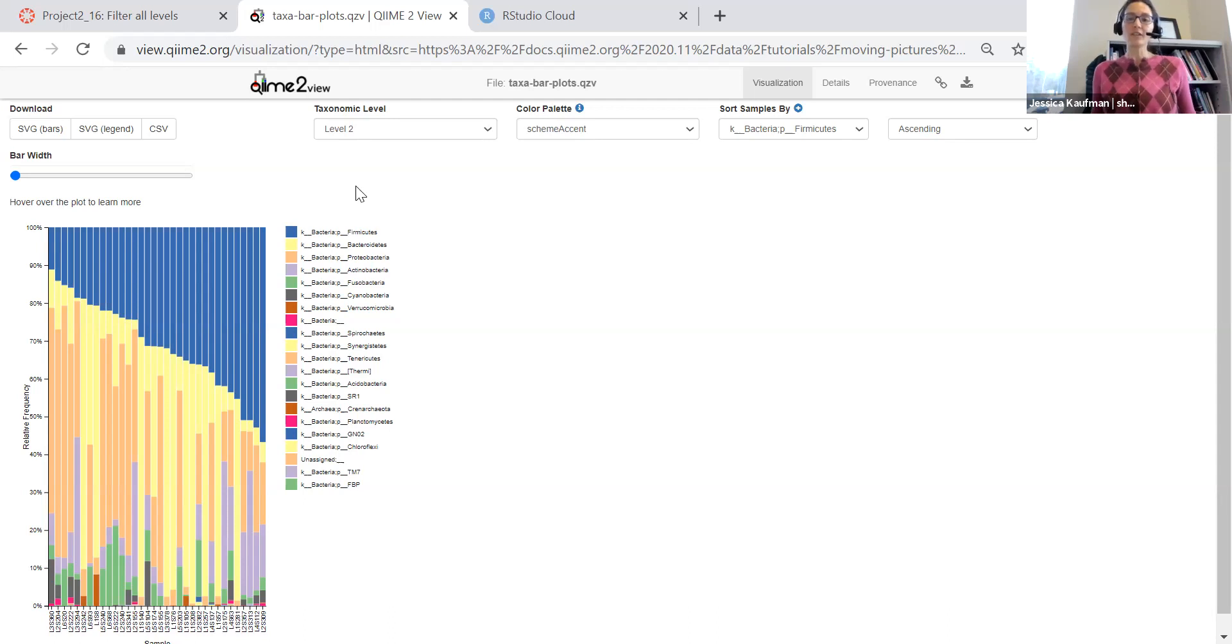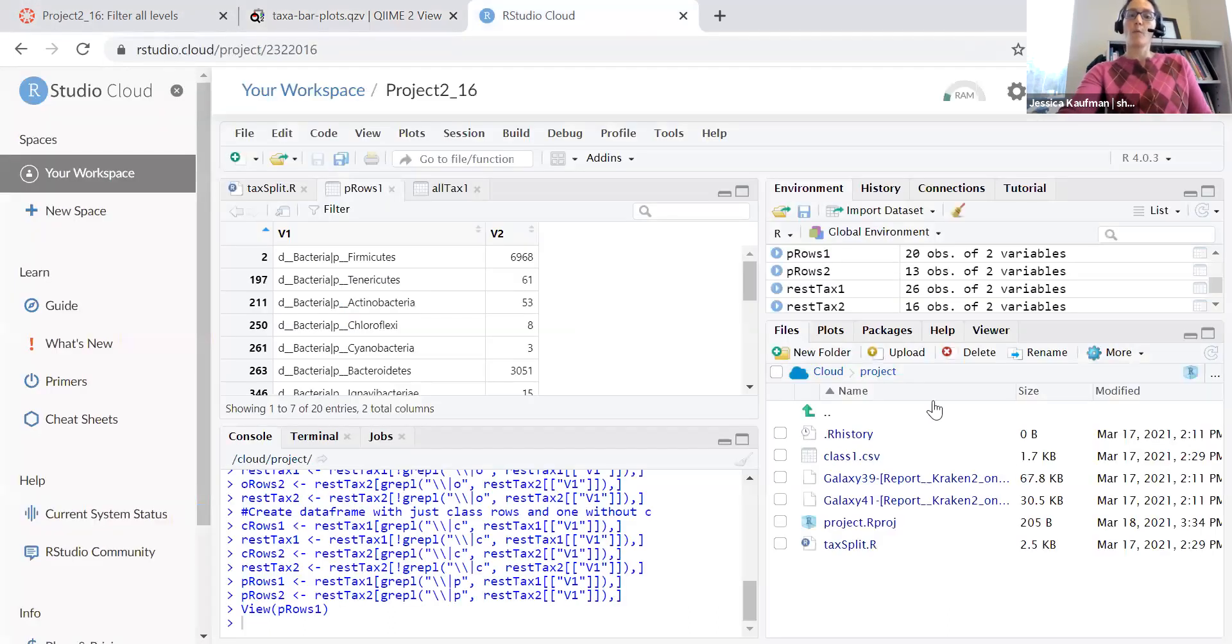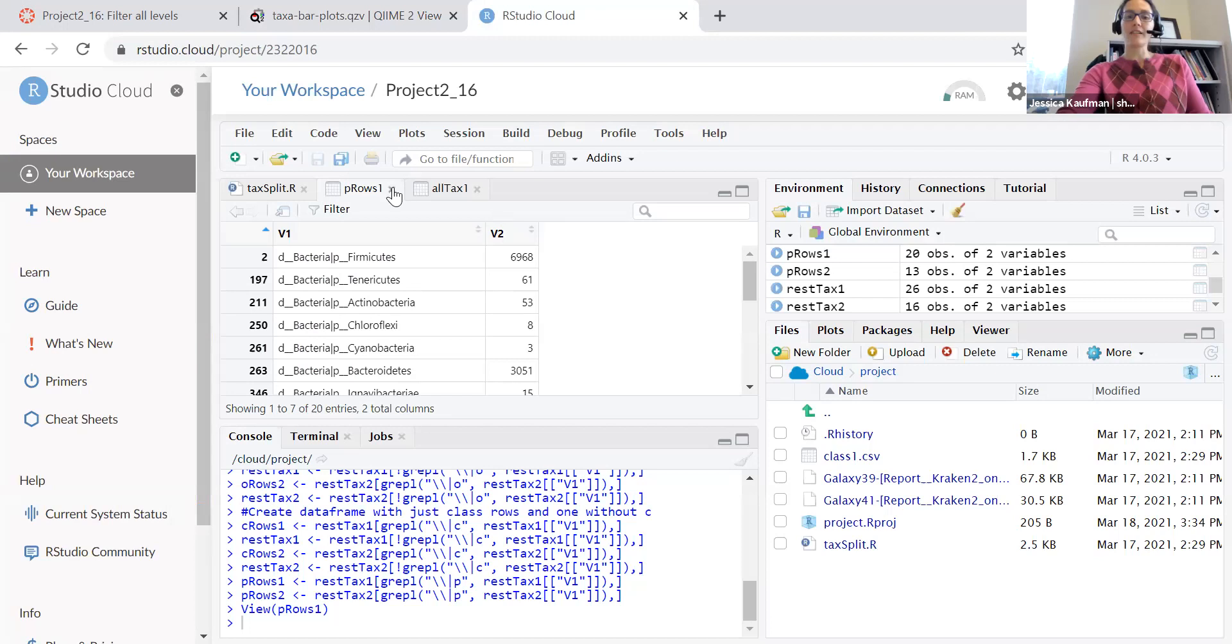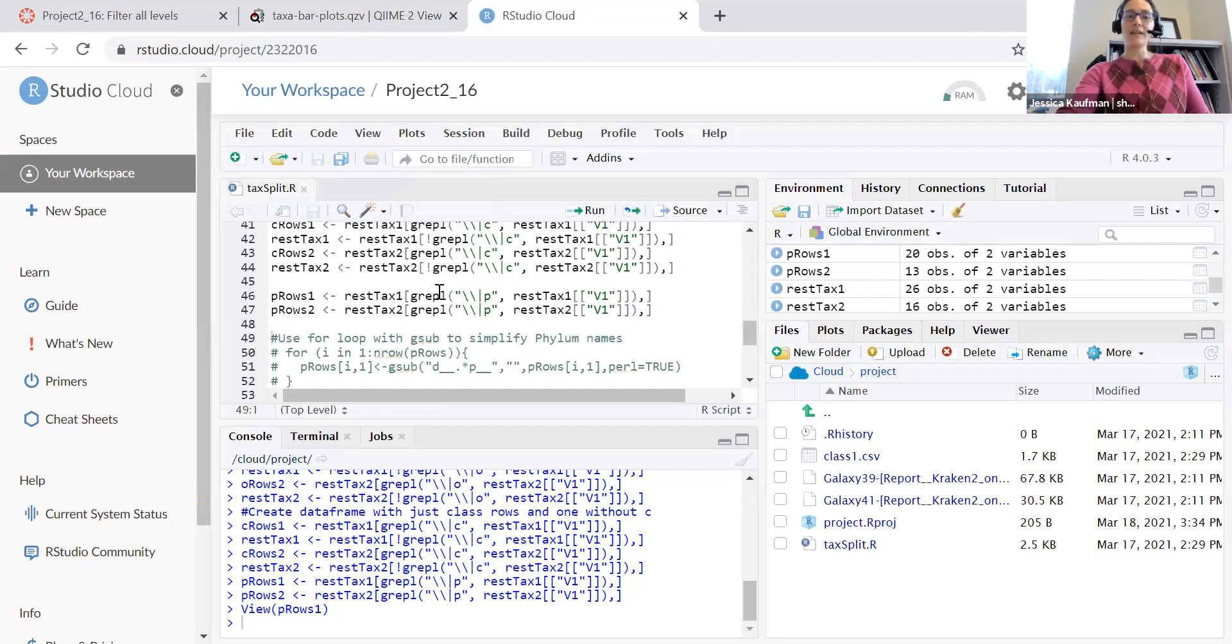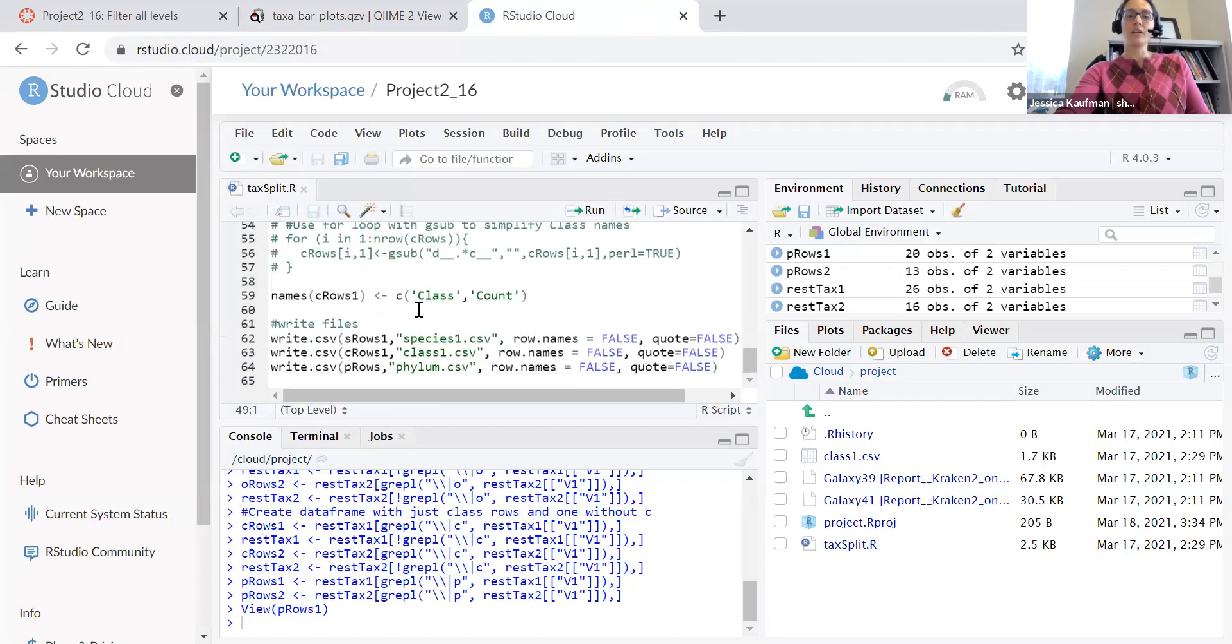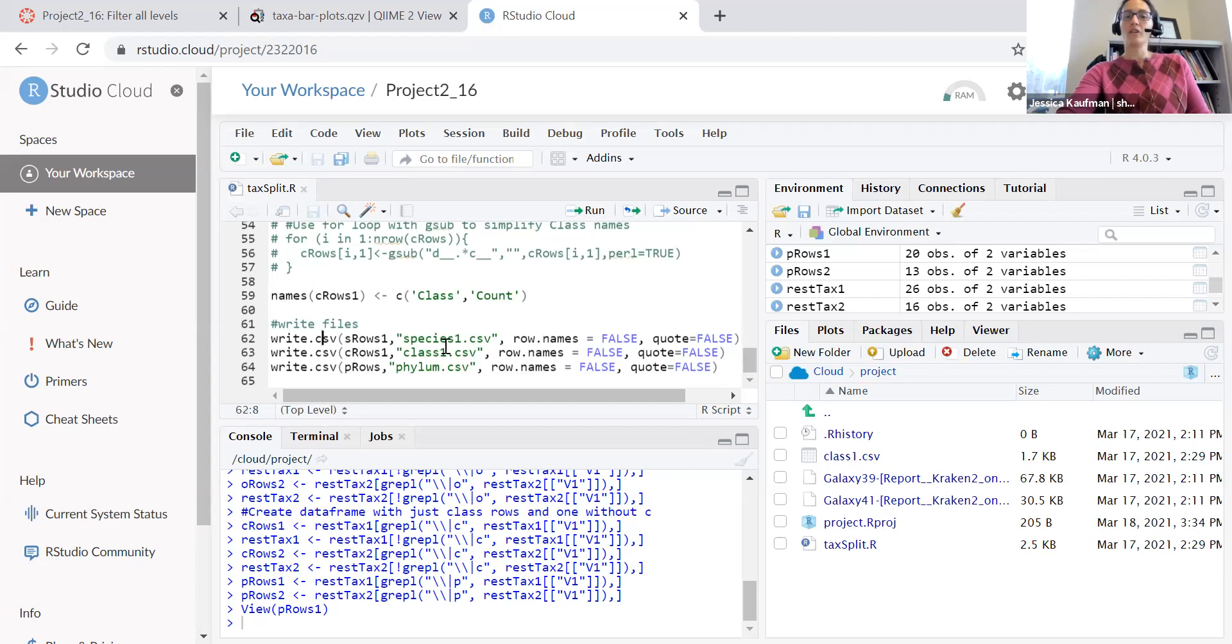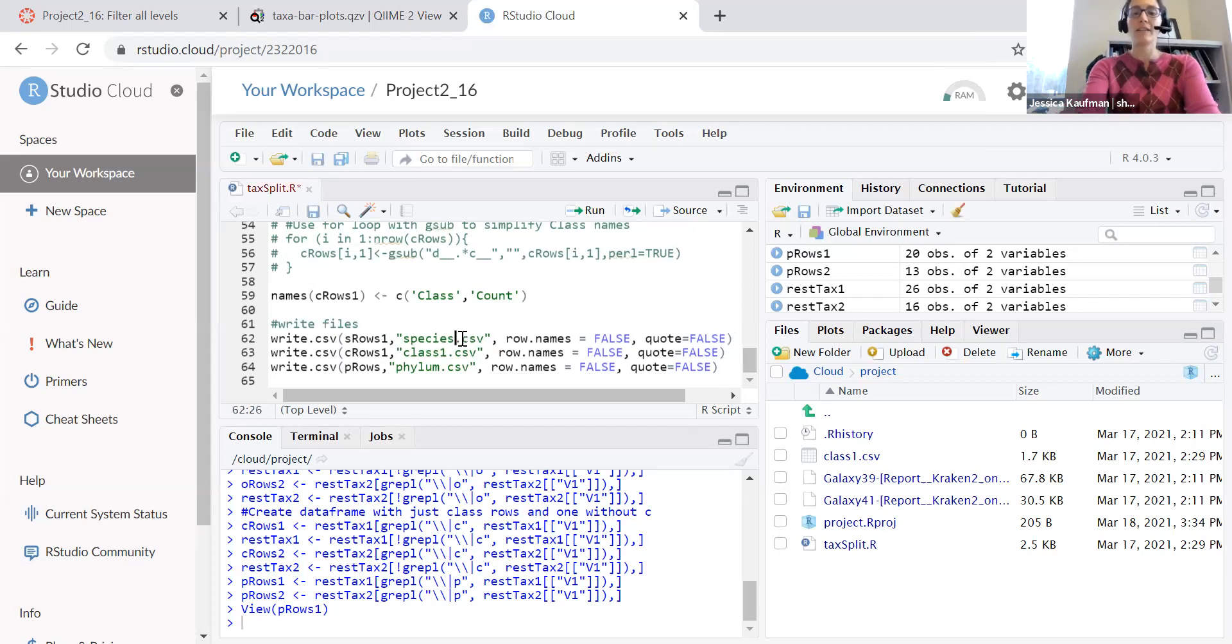So that's your assignment for 216. Once you have separated out everything into data frames, you can use the right, you don't have to clean them up. You can just use the right command to write the first file for species.